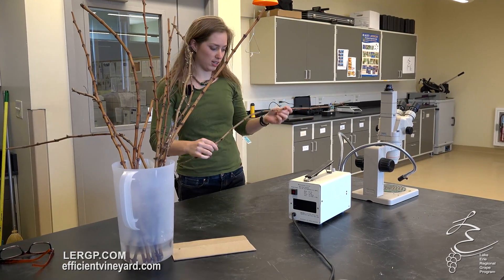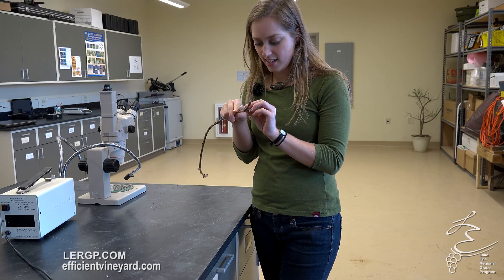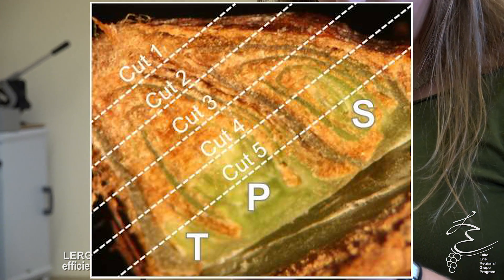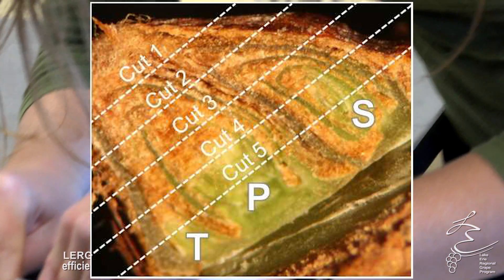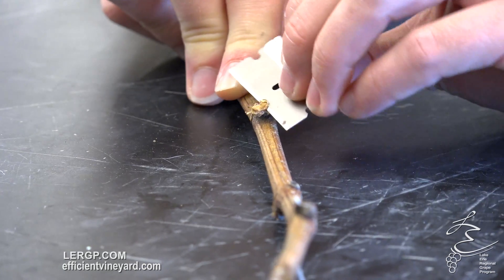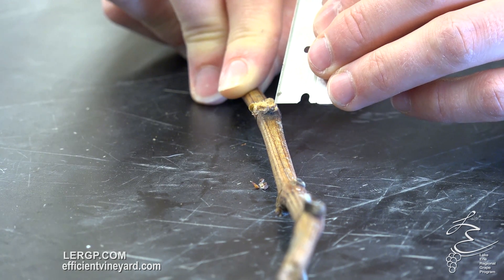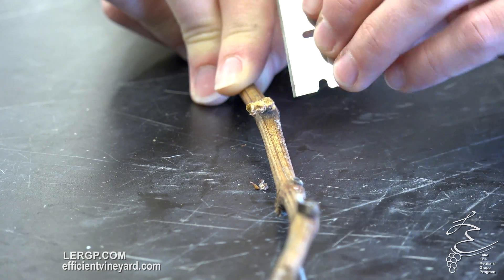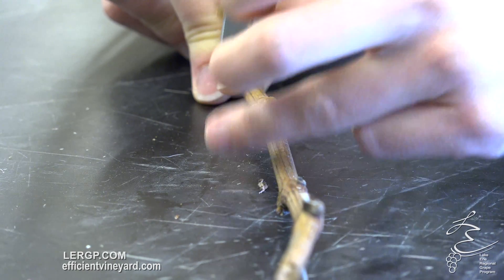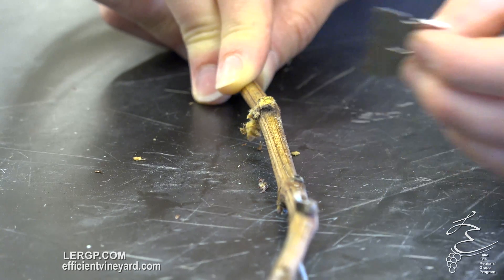We'll grab one of our canes here. A nice sharp razor blade is important. It's pretty crucial to take conservative cuts — you want to take maybe five cuts, just a little tiny slice off the top and then go a little bit deeper. On the first cut, we're not really exposing much, but that's good because you don't want to go too deep since you only get one shot at it really. Each bud is going to have a primary bud, a secondary bud, and a tertiary bud, which tends to be a little bit more difficult to locate. The primary bud — if it's alive, which at first glance here, I'm seeing nice green tissue on the primary bud, which is what we want to see.